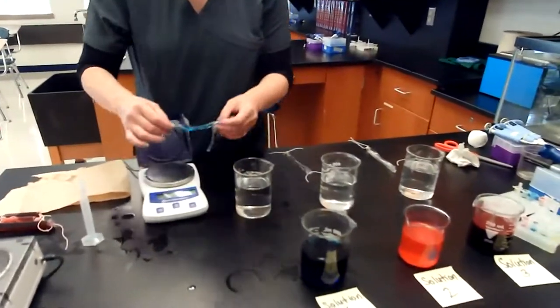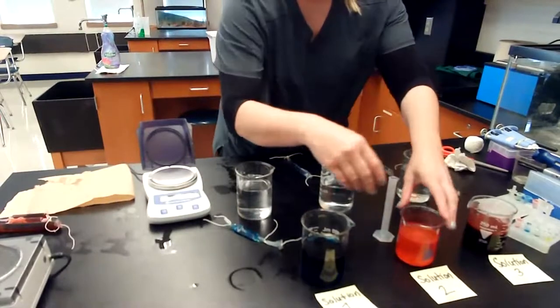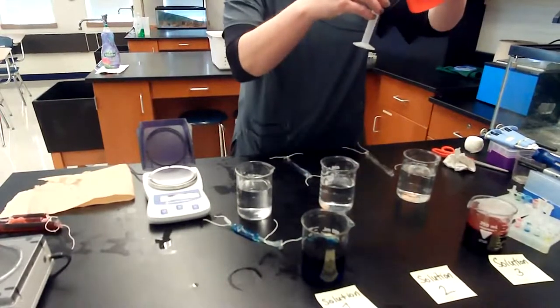And we're going to do this all at the same time. So we'll hold this here. Right? All right. So solution two, same thing, 10 milliliters.